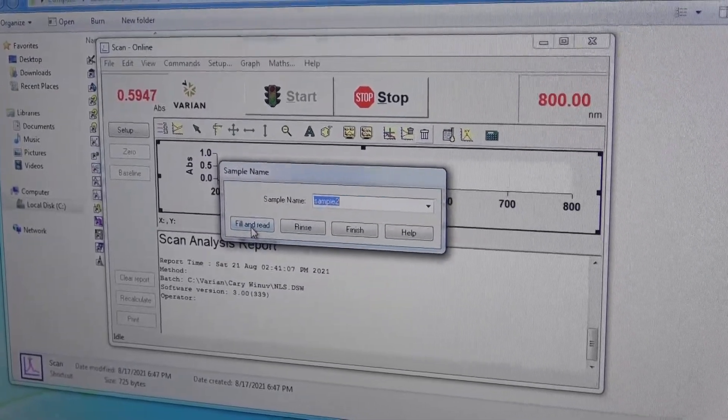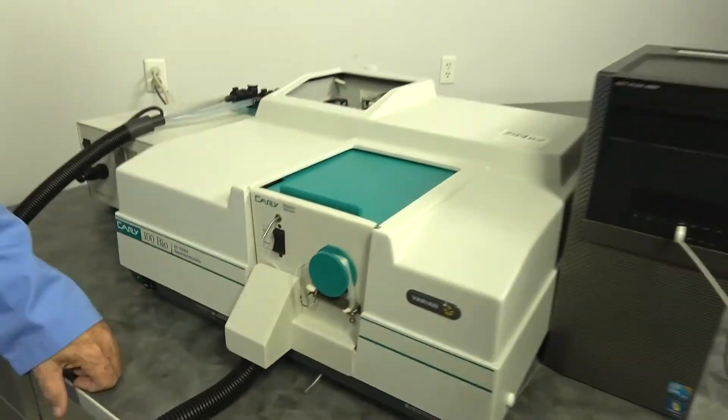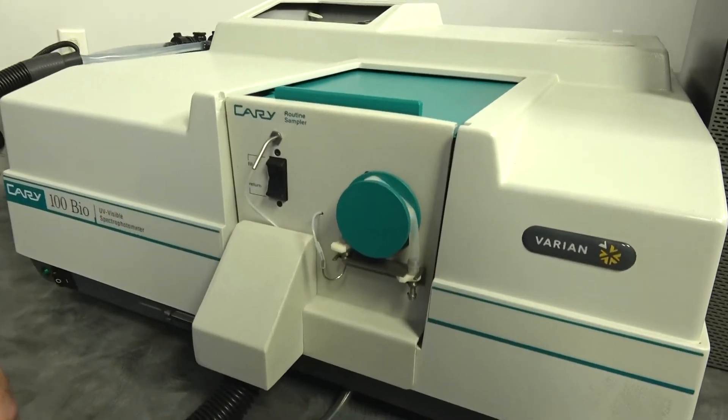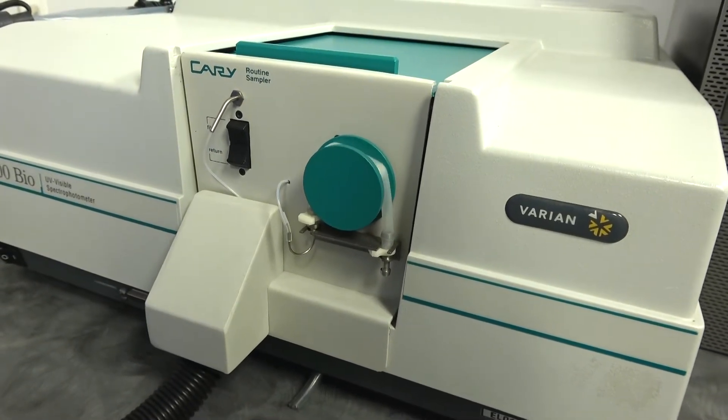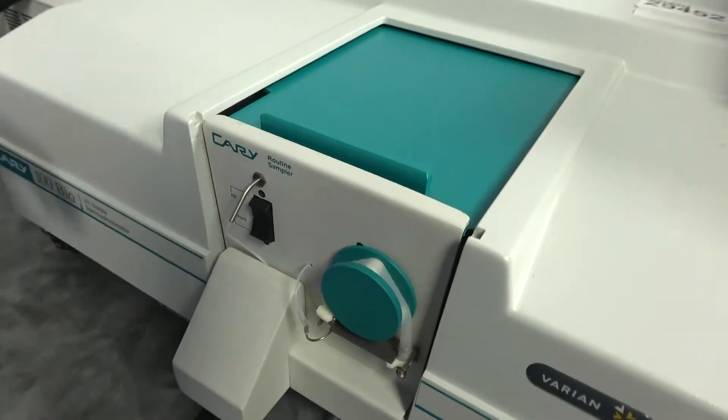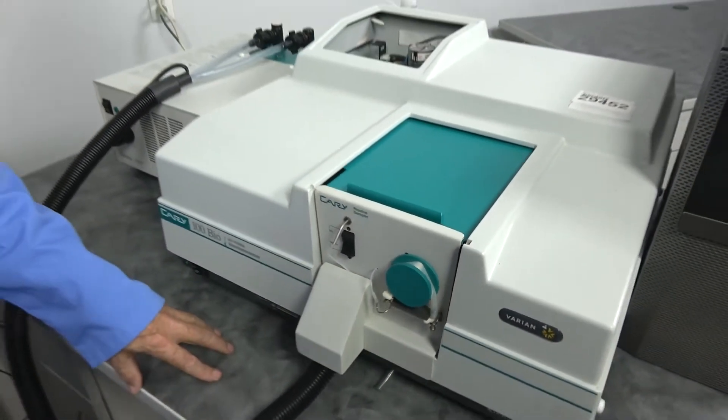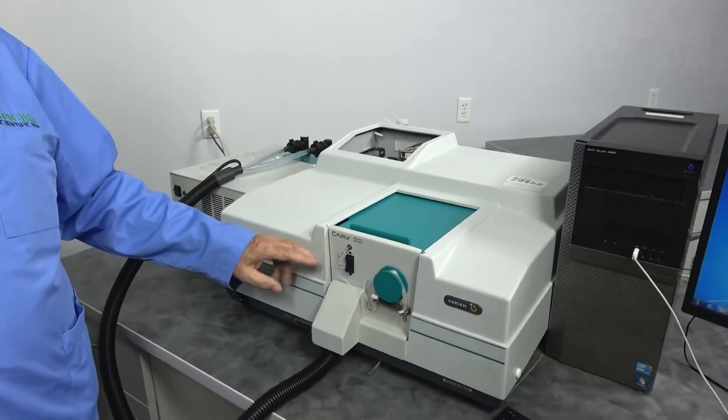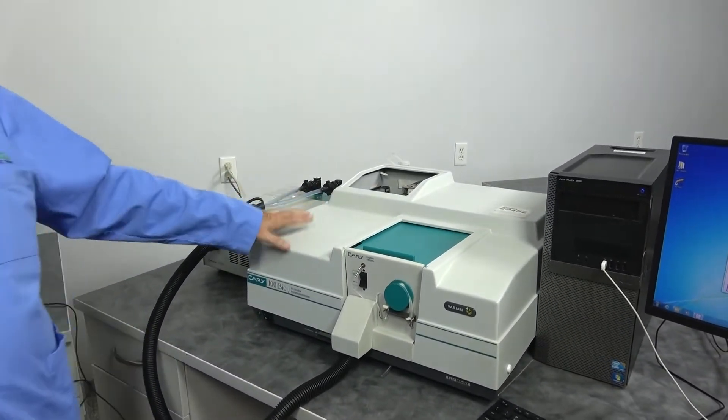You can tell it to fill and read. And your pump goes ahead and starts pumping into your unit when your conditions you've met in the software have reached. It will shut it off and perhaps rinse the sampler chamber and go on to the next one, depending on how you program it.